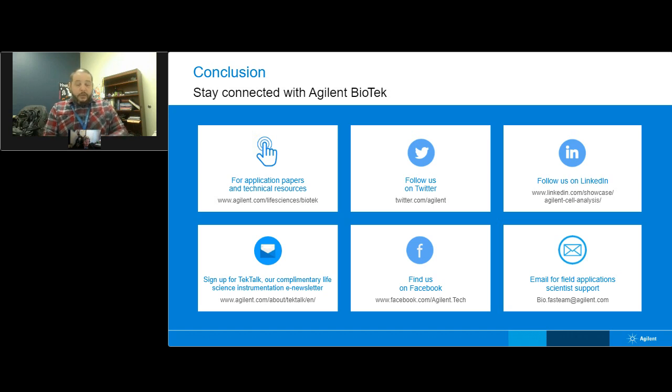So, one, you're limited to the image area. Fine, you can do a montage and build out a larger XY image, but you're still always going to be limited to that short working distance, which is around 250 microns deep. So if you want to image a thicker sample that's beyond that, perhaps a deep sectioning disc is more appropriate for what you're looking at.